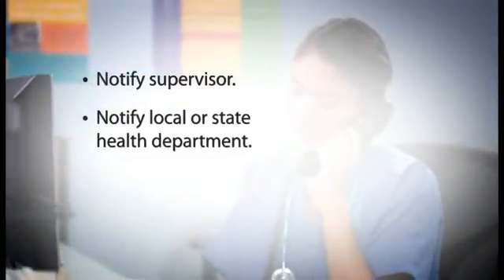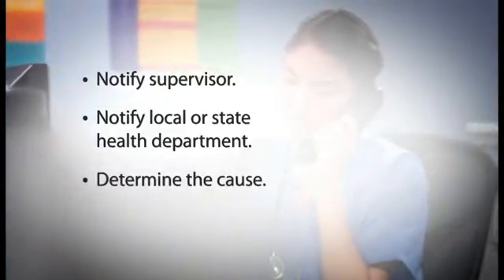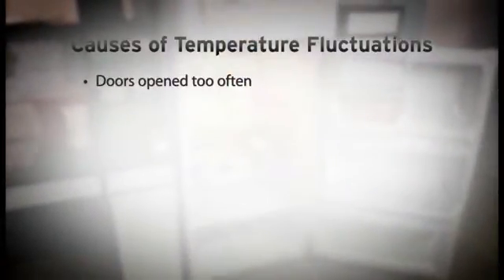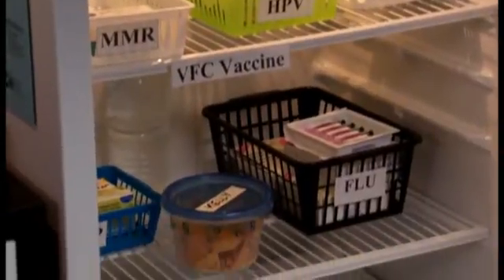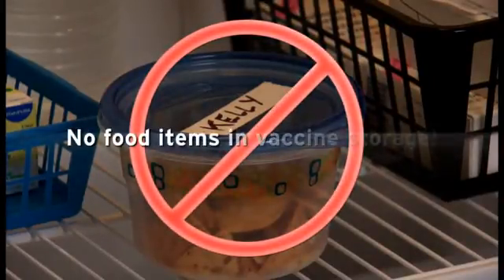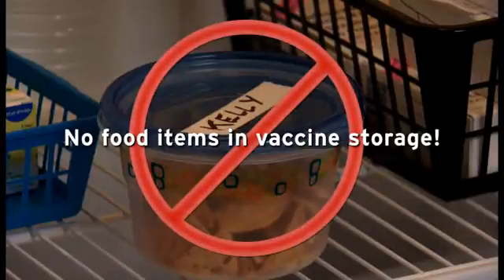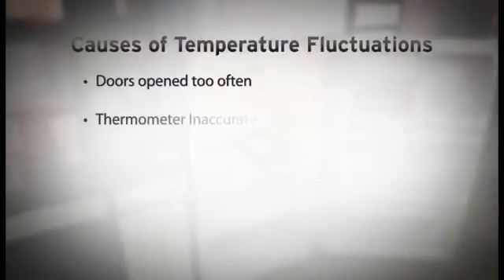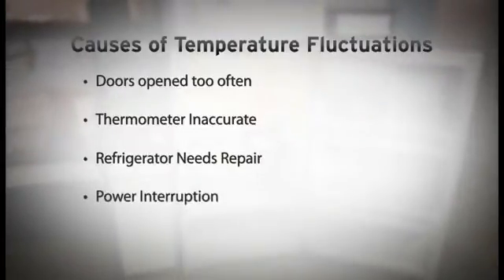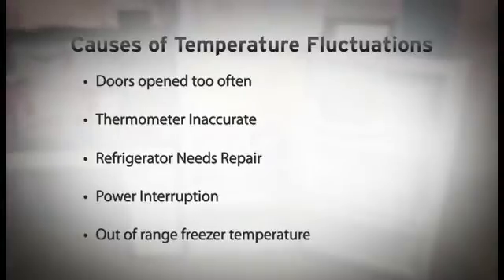The next action is to determine the cause of the problem. There are several factors that can cause temperature deviations. For example, the doors may be opened too often, perhaps because the unit is being used to store food and biological products — food or drinks should never be placed in a refrigerator or freezer used for vaccine storage. Other problems might include an inaccurate thermometer, a unit needing repair, interrupted power, or a freezer temperature so low it affects the refrigerator. Regardless of the cause, immediately address and fix the problem.